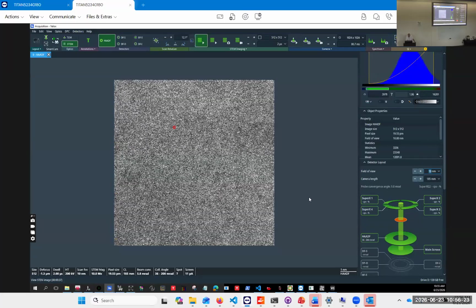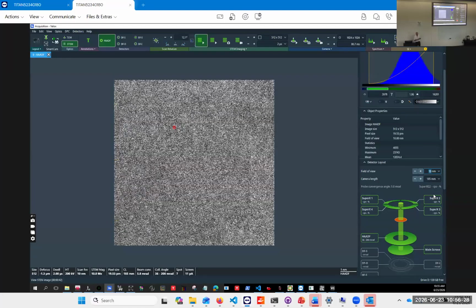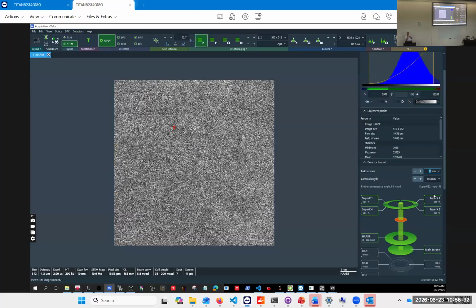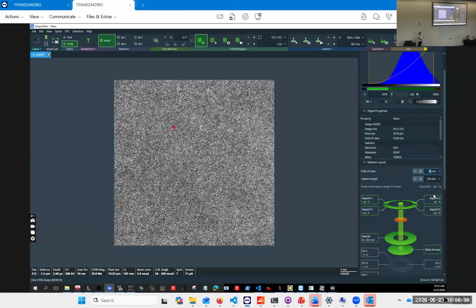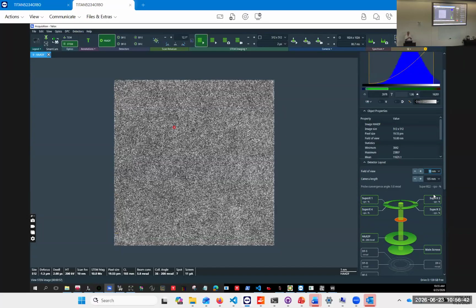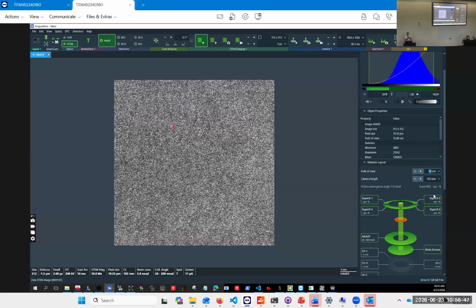So the main point is you get information from the convergent beam patterns when they're not overlapping, and so you can actually go in between. You usually want to have an image and a diffraction pattern, and so you have to make some kind of compromises. So that's the idea behind the whole thing here.